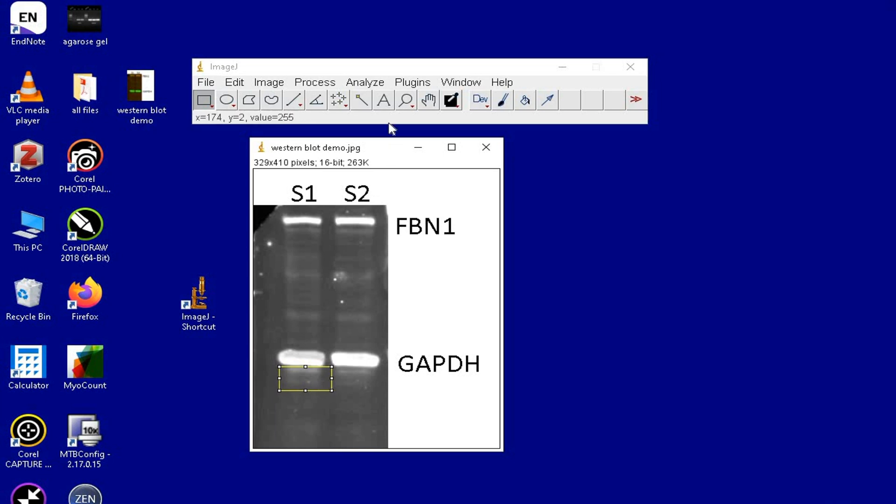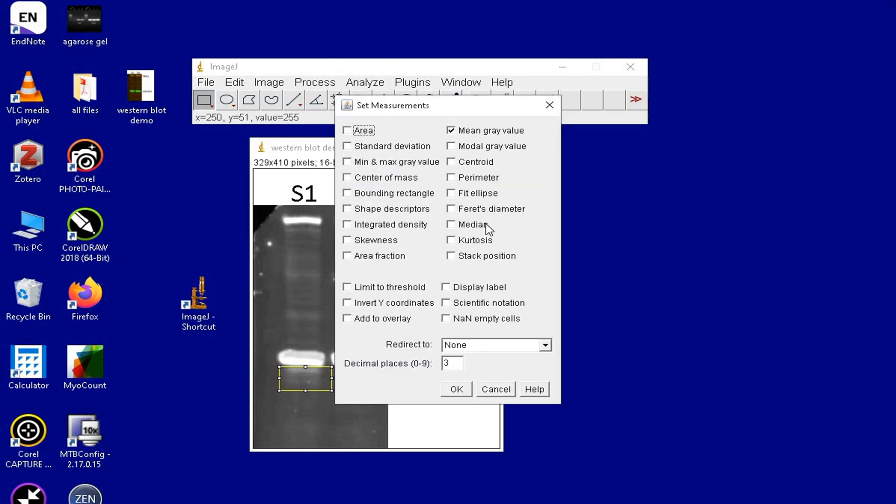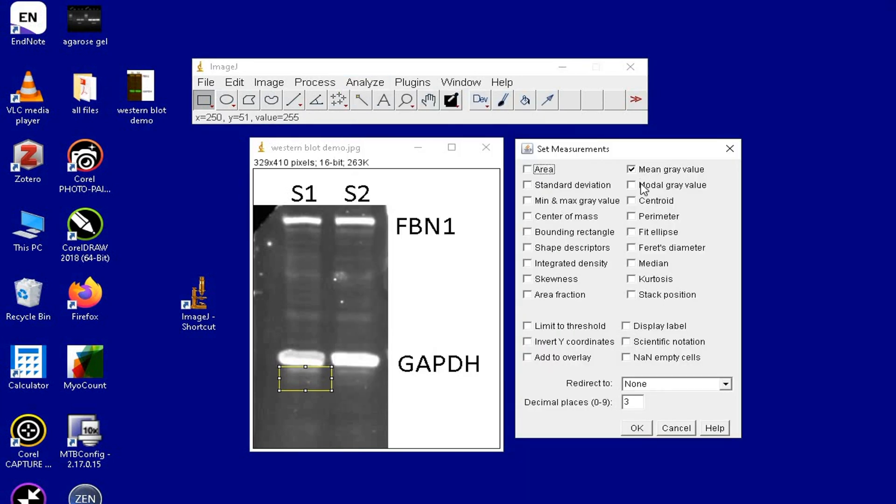Then, click on Analyze and Set Measurements. Except the mean gray value, all the other options can be deselected and then click OK.